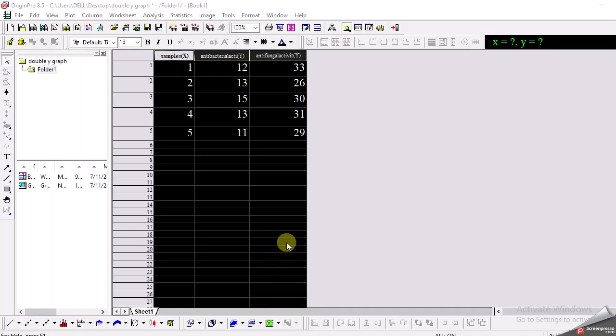Hello guys, today I want to show you how we can plot a double y graph in Origin.